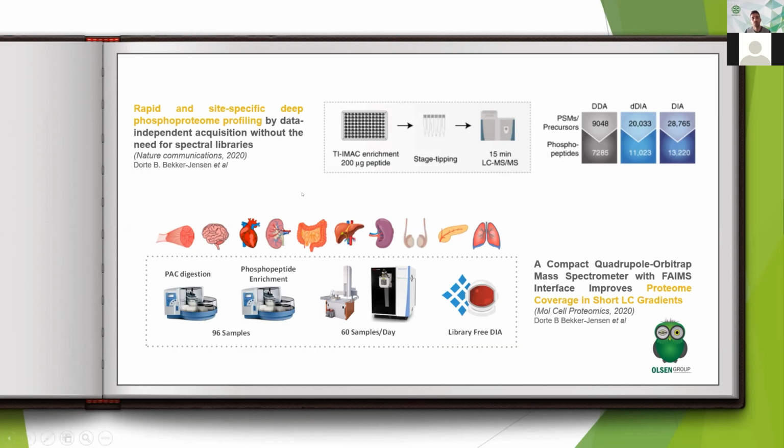And what's really important to highlight here again is that our ability to transform, adapt, and optimize our workflows to make them suitable for this higher throughput DIA analysis was really enabled by our close collaboration with our research partners, and their valuable inputs in terms of how we should develop the workflows.